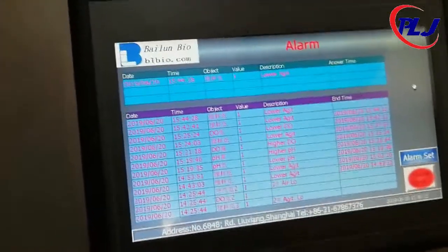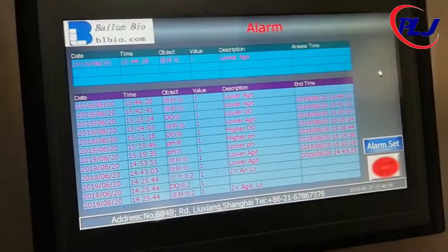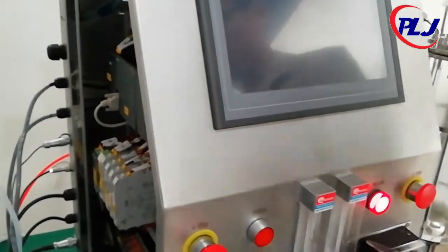When the parameter's control mode is auto and the present value is out of the range of upper and lower limits, the alarm buzzer will sound. But if it is in alarm close and the limits are violated, the alarm buzzer will not sound.